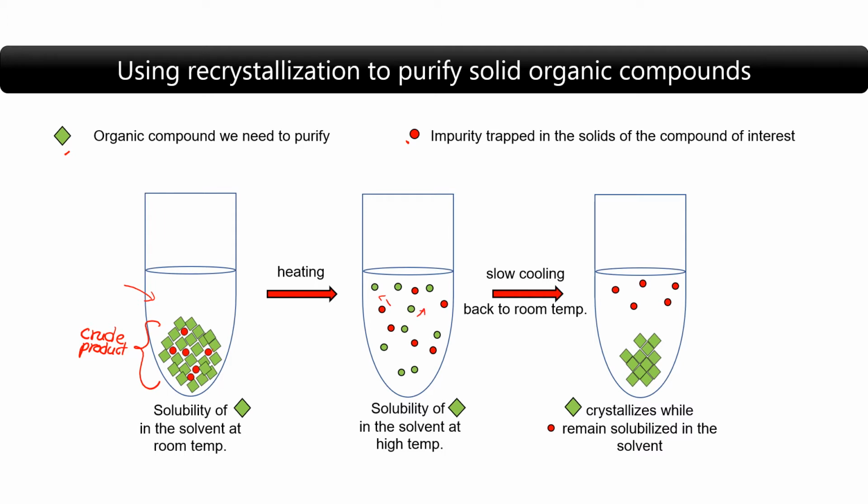Next, we allow the solution to slowly cool back to room temperature. Since the green crystals are not soluble in this particular solvent at room temperature, they're going to start to form the solid crystals again.